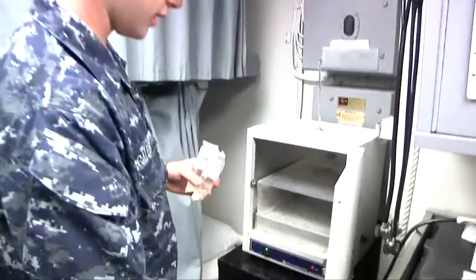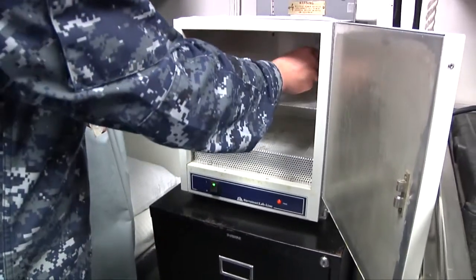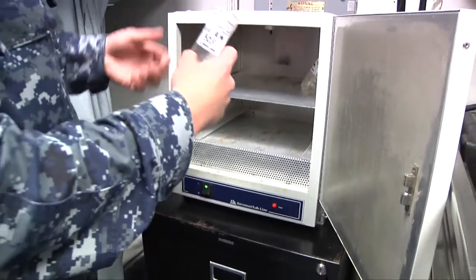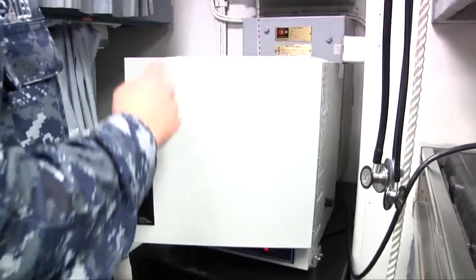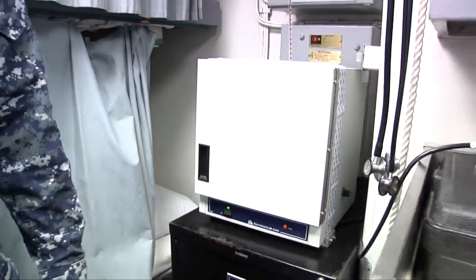So this is the incubator we're going to put it in. It's already turned on because we've been using it. Just want to set the samples upright because they tend to leak out of the top — it's not the best seal. And we just sit there and time it for about 24 hours from now, so about 9 o'clock tomorrow morning, come and get it out and check it compared to this.